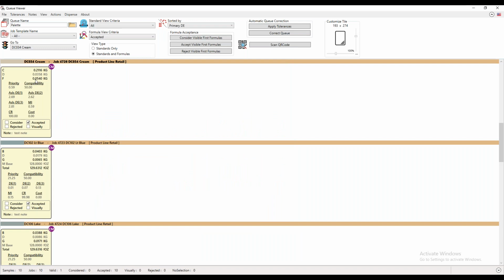You'll notice that the formula has now changed. The formula is now as is delta E 2.69. So basically my initial weigh-up is off based on what I really wanted this formula to produce. I can then go through here and click on every other sample that I have and measure in that particular color. Again, if I have a QR code, I could scan the QR code if I have that with the paperwork, and it will take me to the right color.